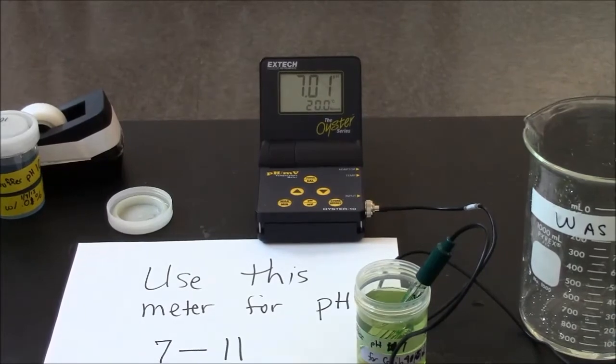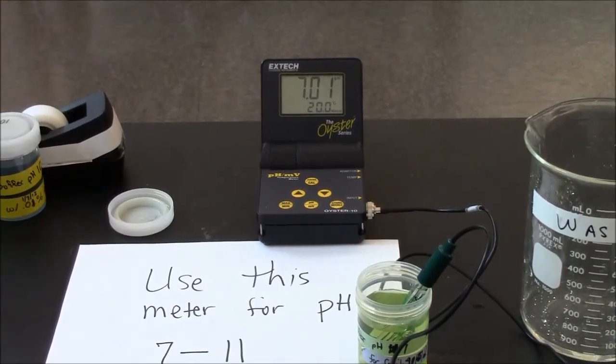When you measure your pH, make sure your entire team is here. Some people have not yet learned how to use a pH meter. They let somebody else do it last week. So make sure your entire group is here for measuring the pH.